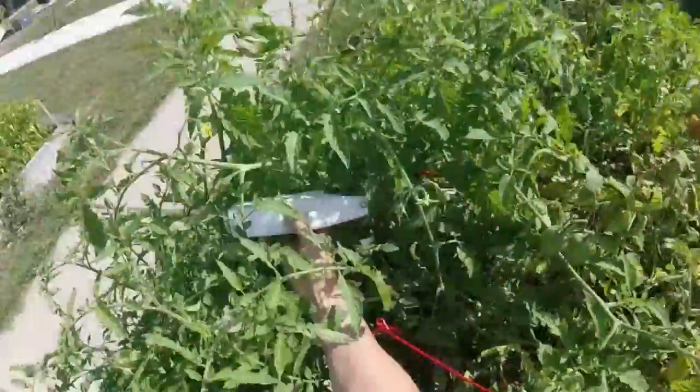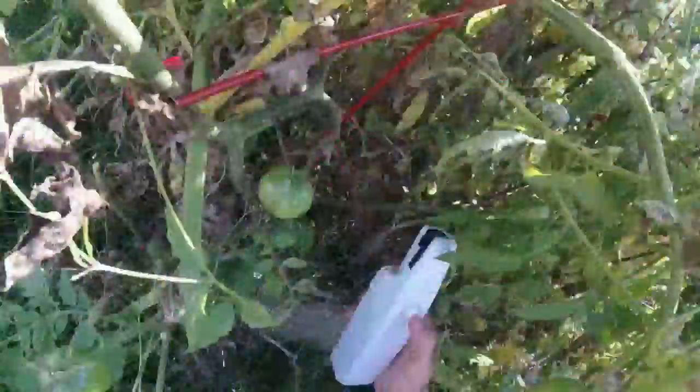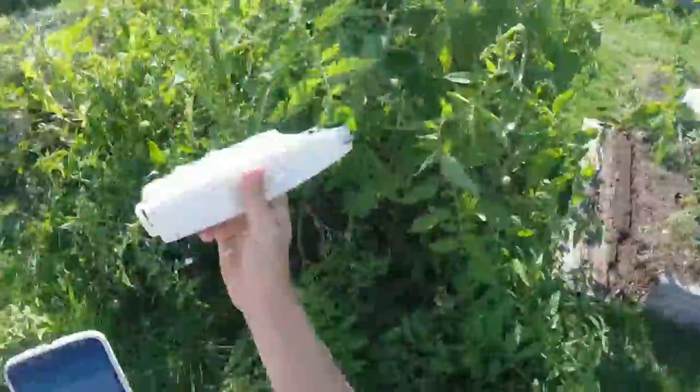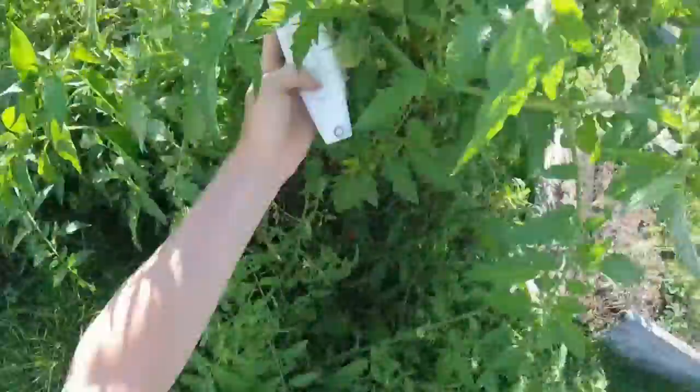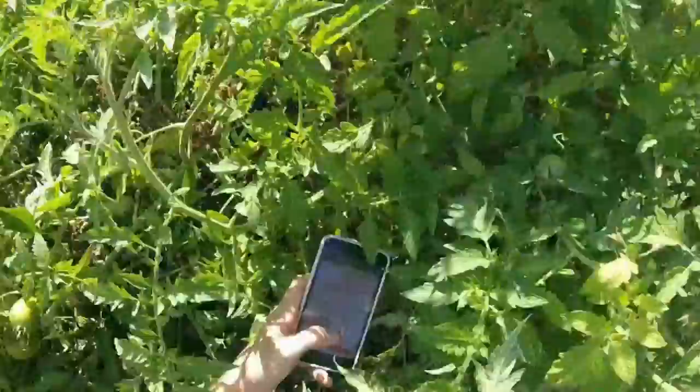While it's loading, this is me collecting a few more data points from two tomato plants so we would have something to play with.